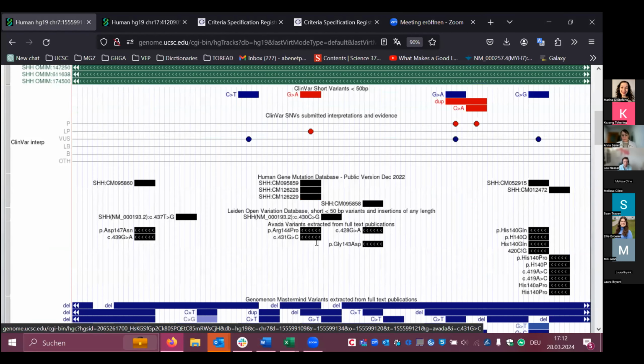If one clicks here, it will automatically open the details page for this item. So this is the link to the GenCC gene page, and here is just information from the GenCC page. The format is not as nice and colorful as GenCC, but the information is the same.